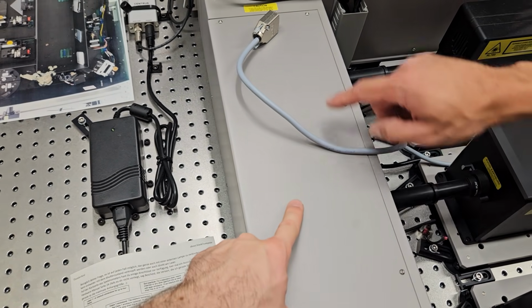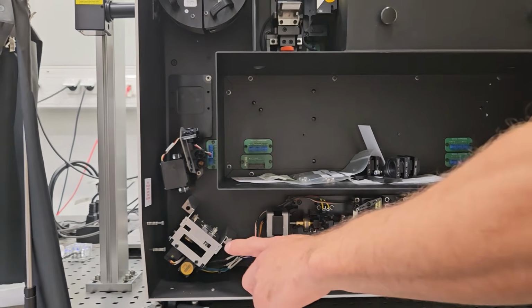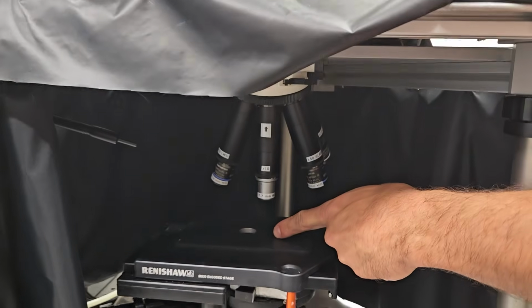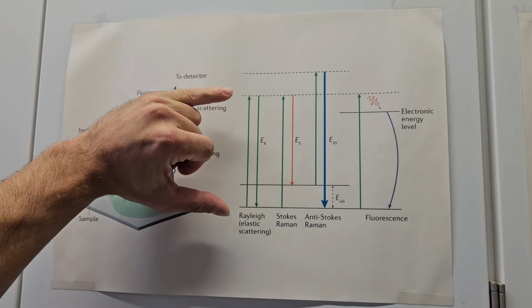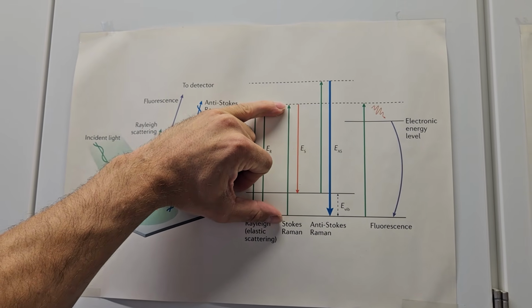Through a few lenses and mirrors, the monochromatic green light hits the mirror, which directs the light via further mirrors through the microscope and then into the sample. Then something amazing happens. A chunk of light is simply scattered elastically. This is called Rayleigh scattering. This light does not provide us with any kind of information and simply overloads the measuring electronics.